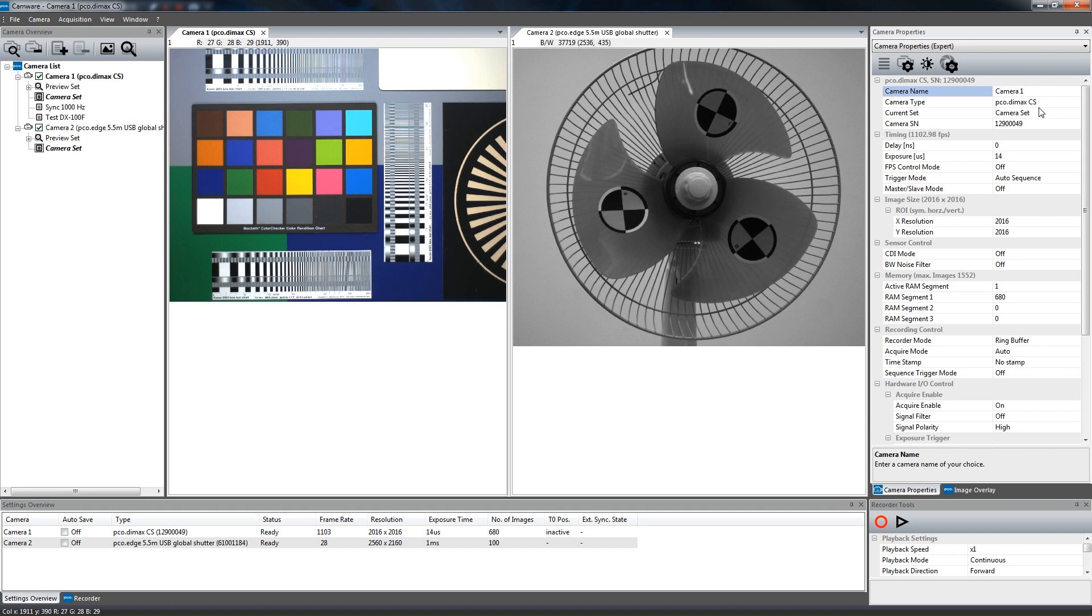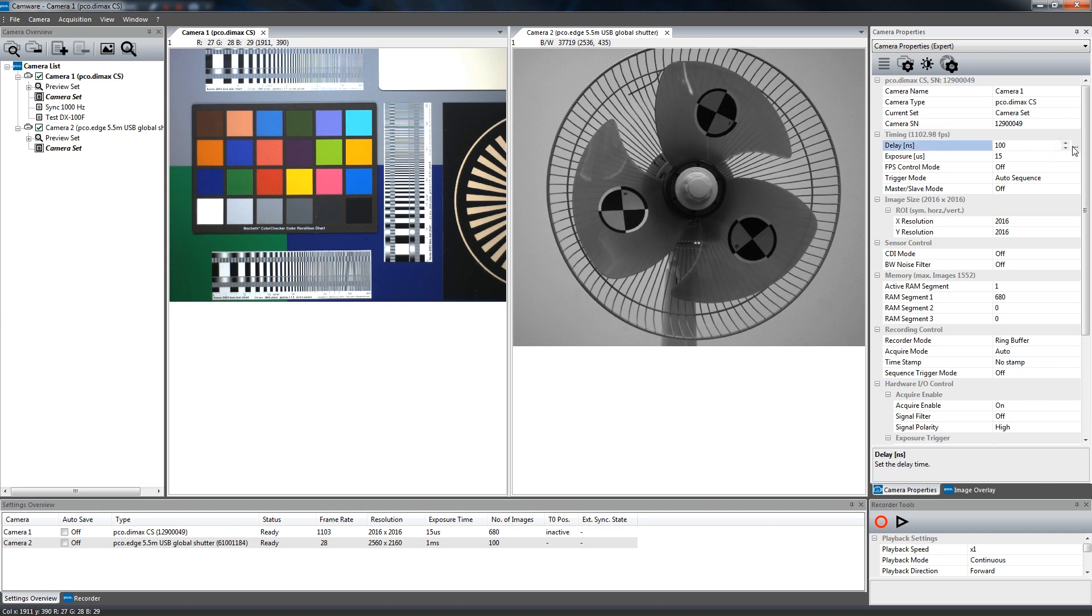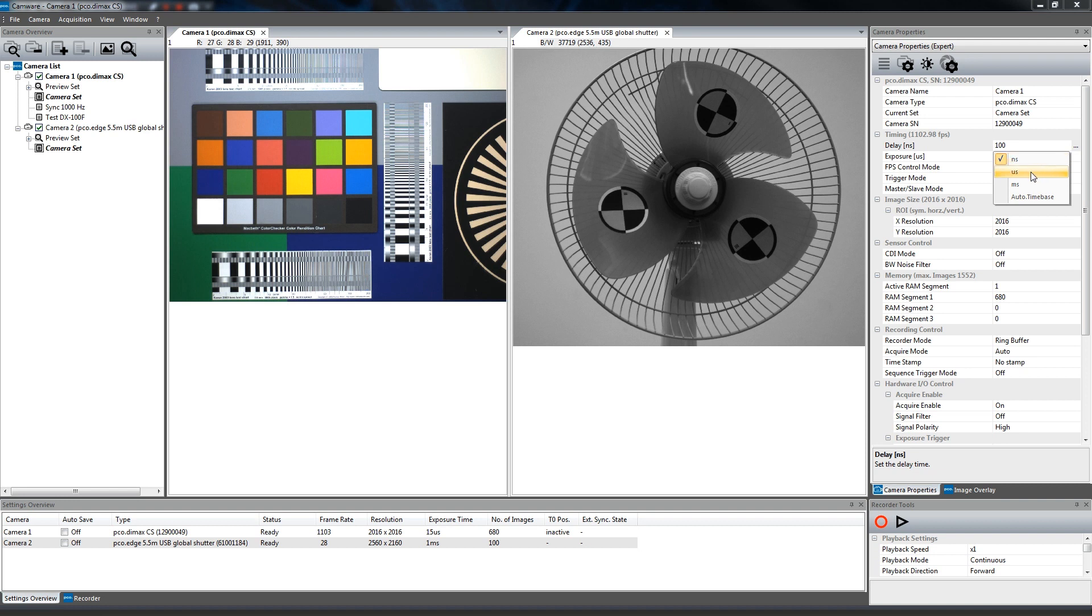Timing is the most important settings for recording images with your camera. Set a proper exposure time and, if necessary, delay time for your experiment. CamWare automatically calculates and displays the maximum achievable frame rate based upon timing and ROI settings. Easily change time base by clicking here, and the respective window opens. The time base can be set to nanoseconds, microseconds, milliseconds, or automatic.